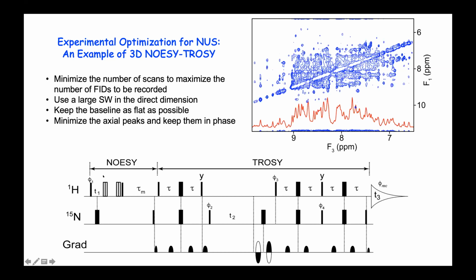It's not going to improve the RF inhomogeneity, okay? So therefore, you don't have linear phase correction. But for the composite pulse, you need 2 of them because otherwise it causes phase distortion. So we do that in pair, apply this at the end of it, okay?